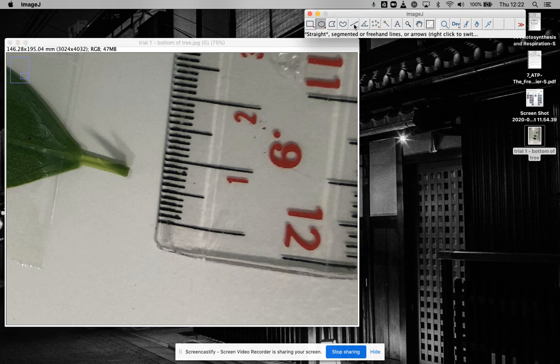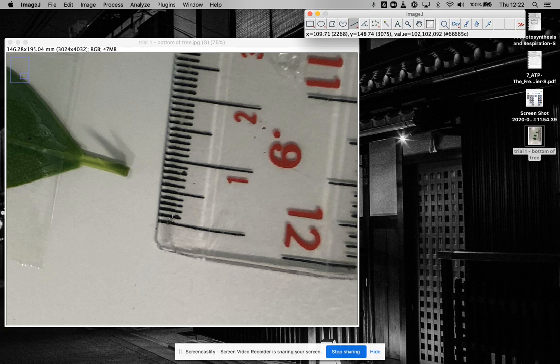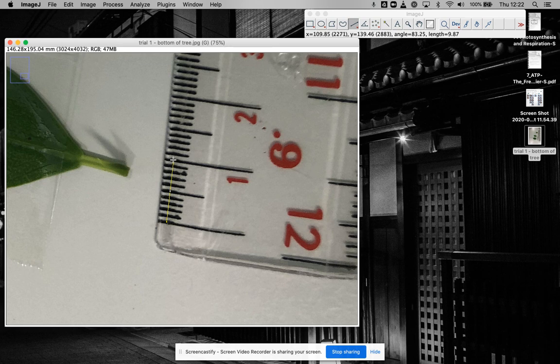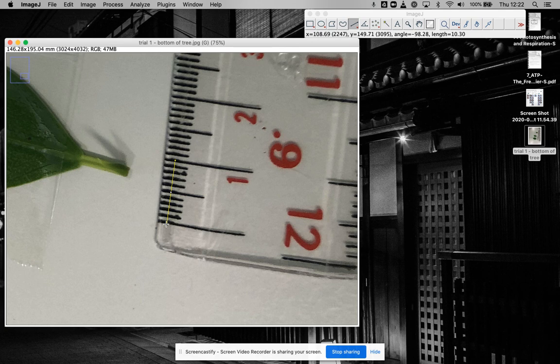What I can do is use this line tool to measure. I'm going to draw a line from that point to that point. I'm going to straighten that out a little bit. I know that that distance is 10 millimeters, or one centimeter.